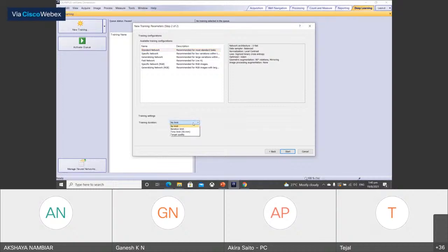And training means that the neural network will be created by using lots of iterations of the training. You can set the duration, how long you would like to do the neural network training. So I'll just go with no limit.